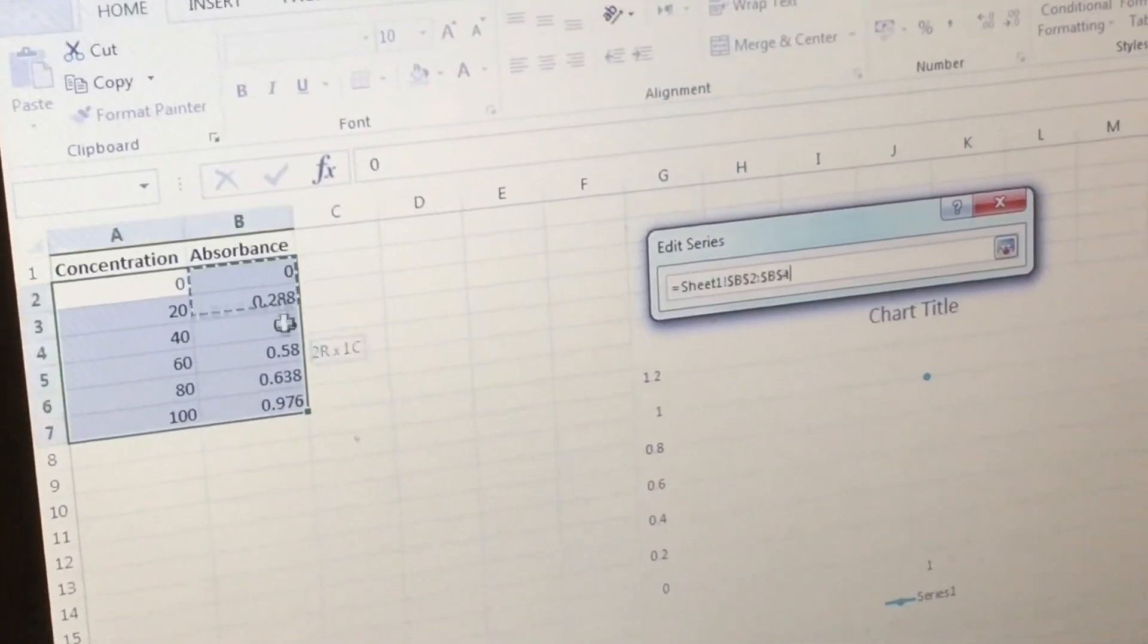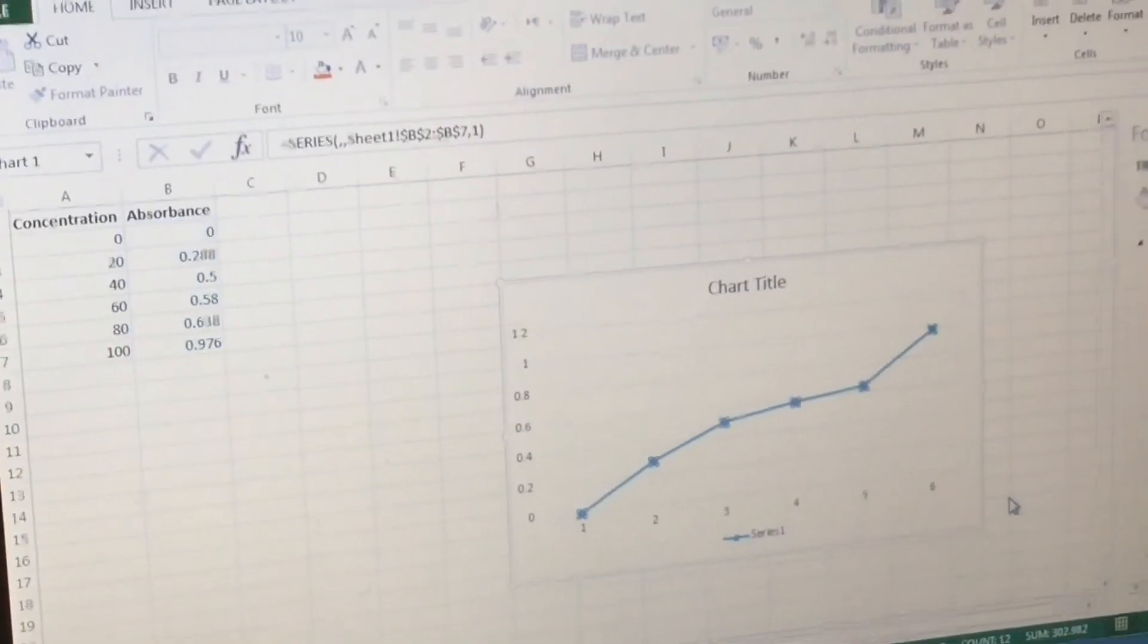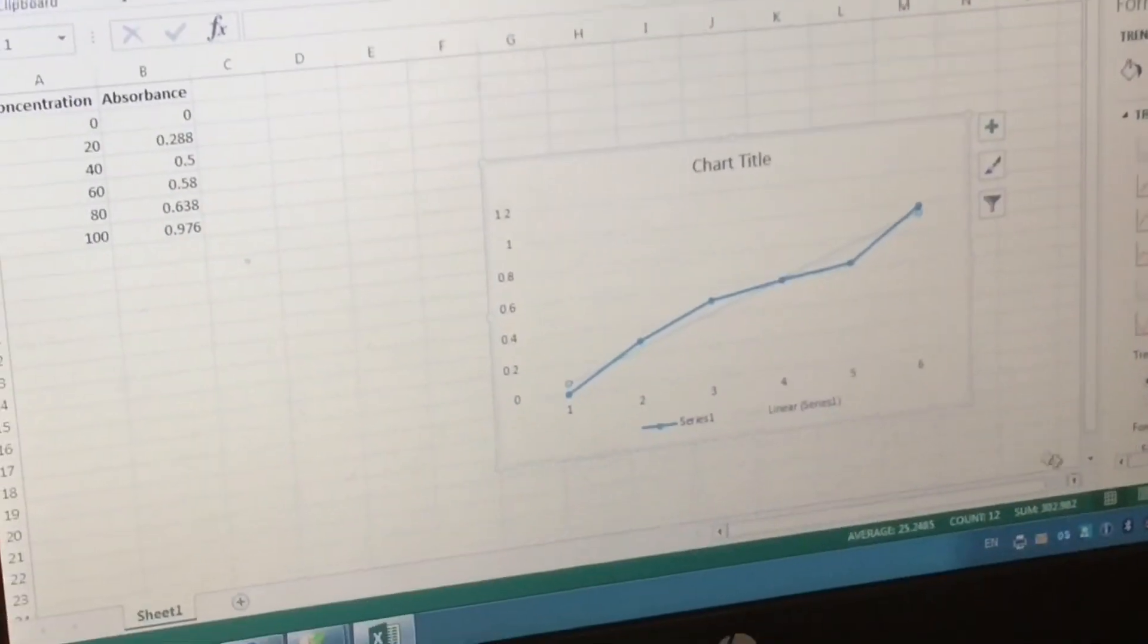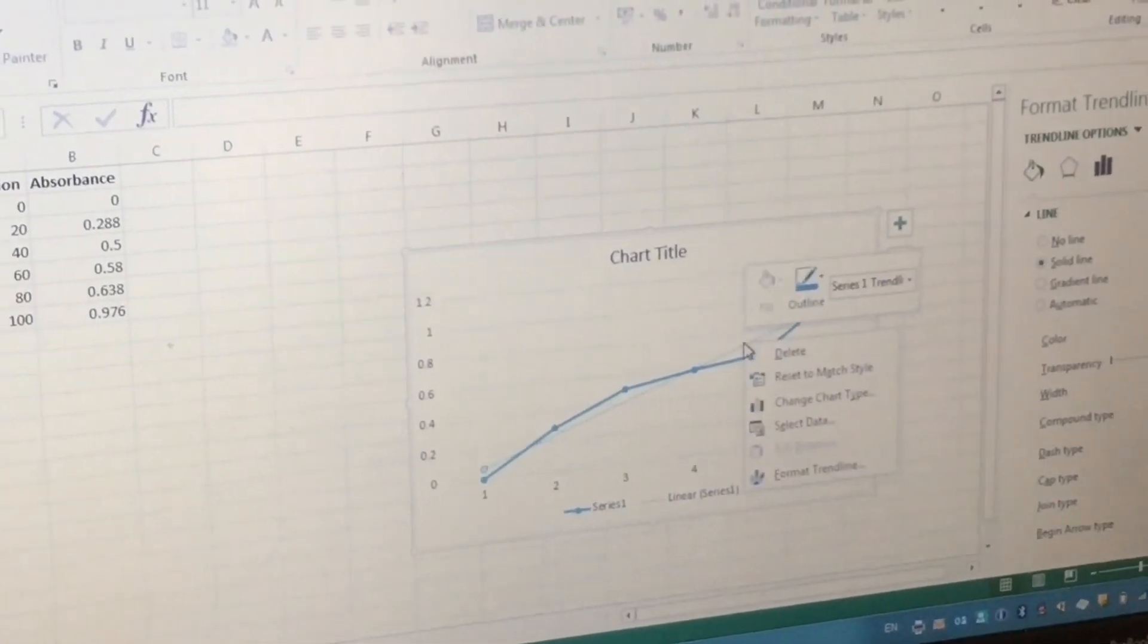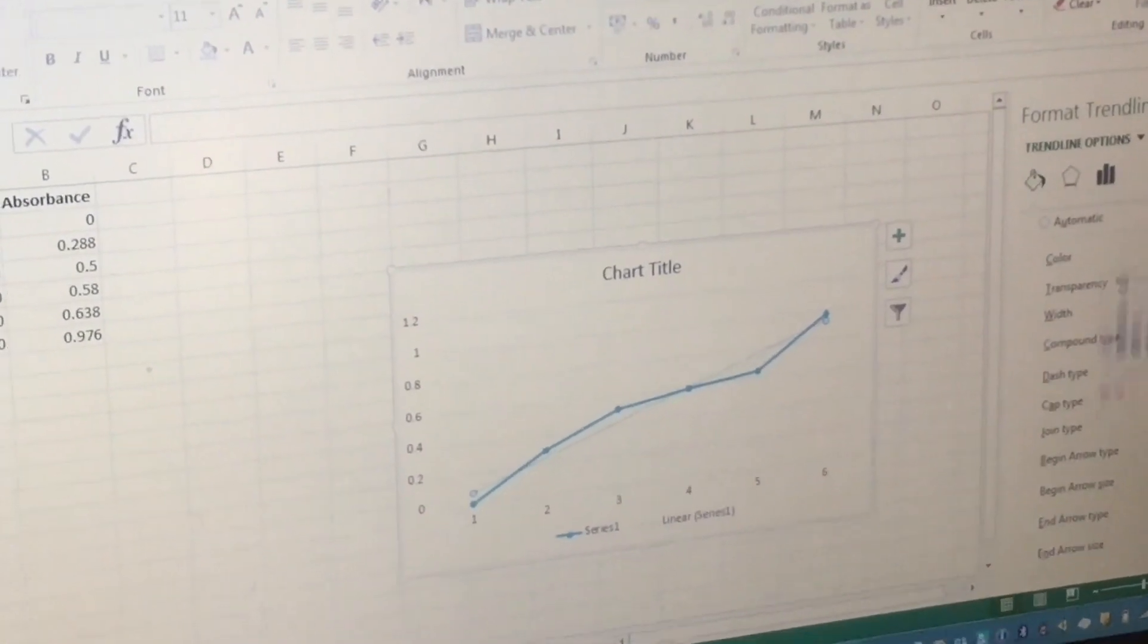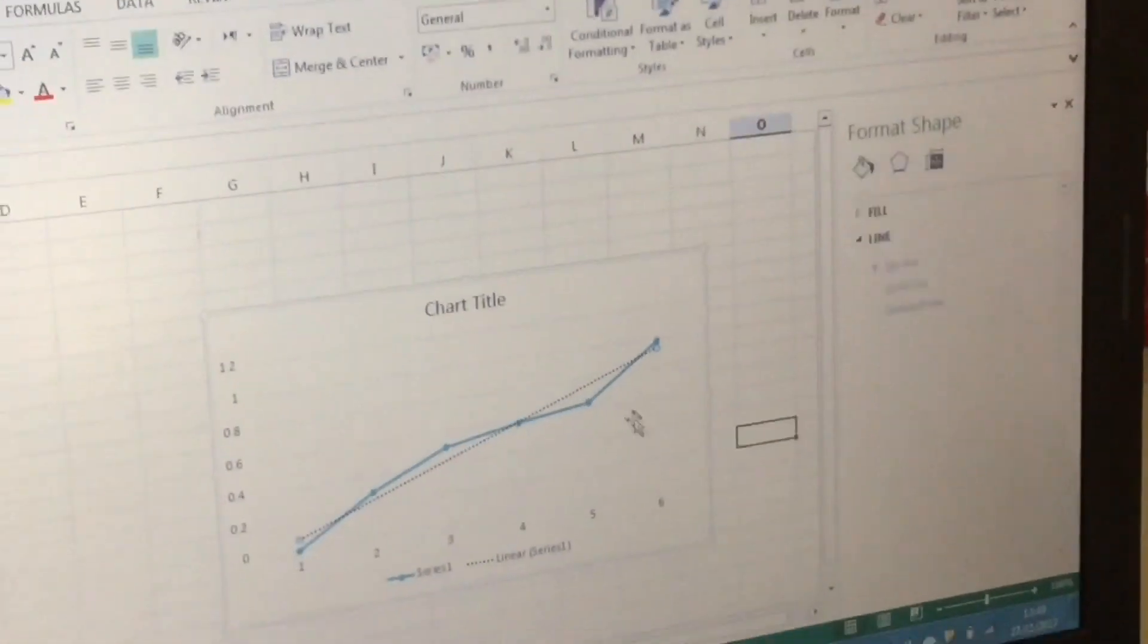We're then going to plot the results using Microsoft Excel. What we'd expect is a linear line, but in fact we've got some anomalies on this. We're going to do the line of best fit and then just going to fiddle about there to make the line of best fit the dominant line and supersede the other line.